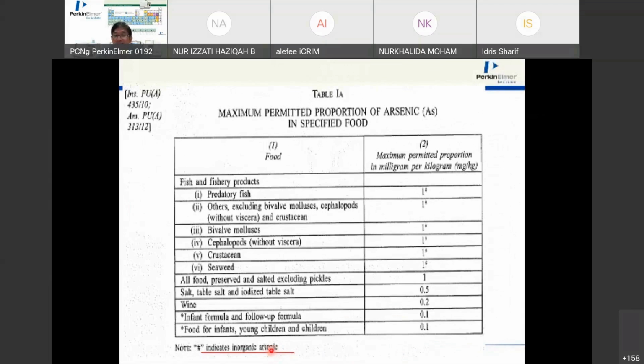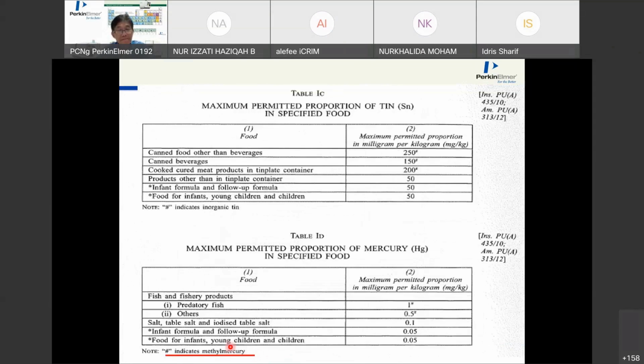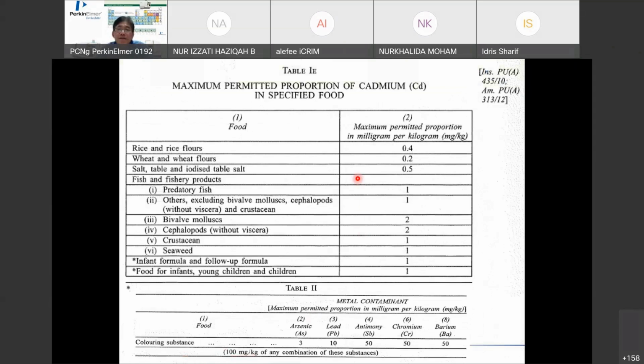Arsenic, like in fish samples, is inorganic arsenic. What does it mean? That is arsenic 3 and arsenic 5. Arsenic has many forms, like arsenobetaine, MMA, and this sort of thing. So the technique is HPLC hyphenated with ICP-MS. It's LC-ICP-MS to do arsenic 3, arsenic 5. Same thing as mercury for fish products: methyl mercury, mercury 2, ethyl mercury, HPLC hyphenated with ICP-MS to do species determination.